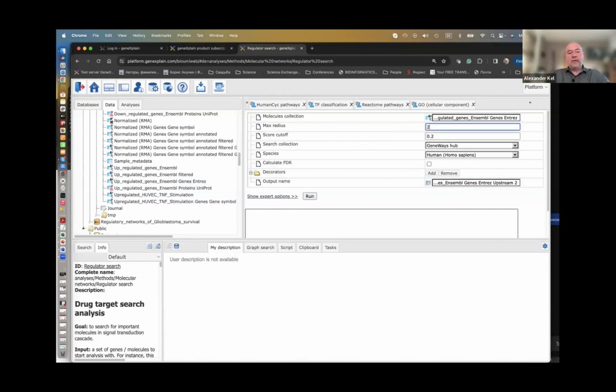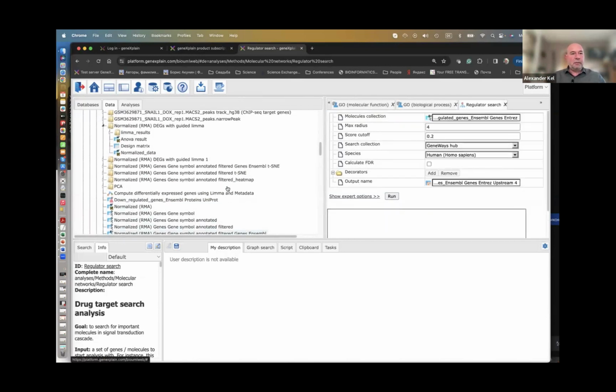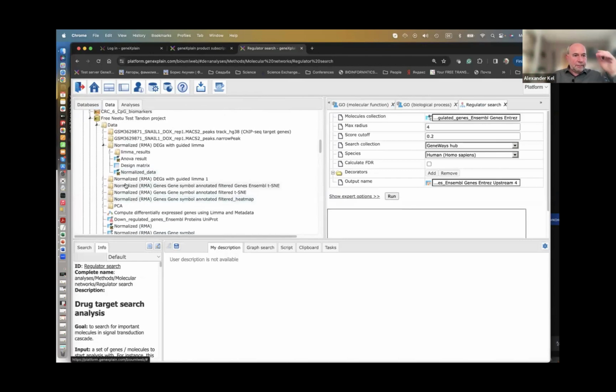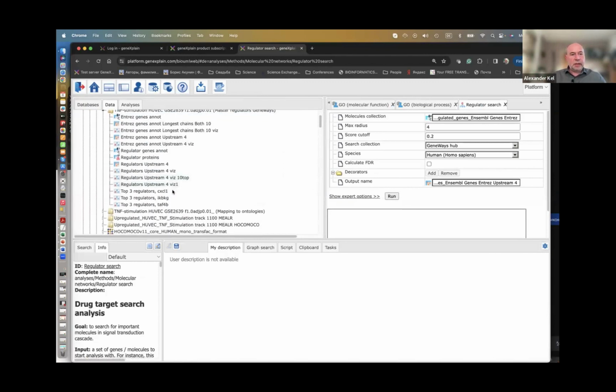You specify how far you want to go, upstream or downstream, and you run it. It takes a bit of time, so I will just show you results of that run. Let me see. I was here. So, master regulators using GeneWays.